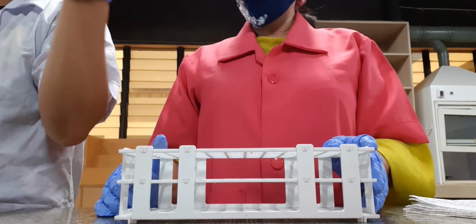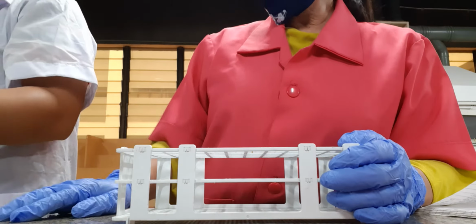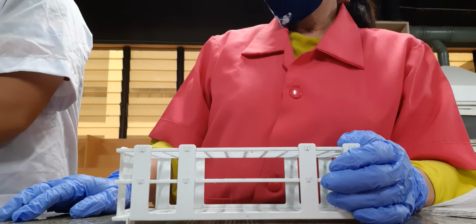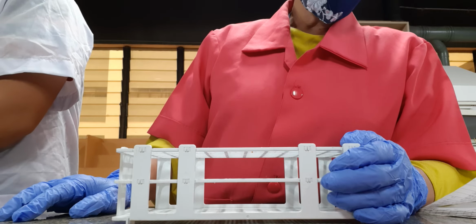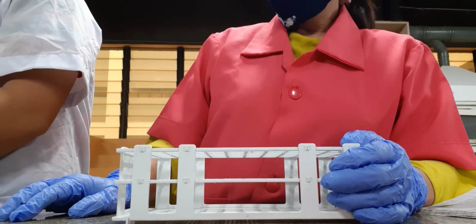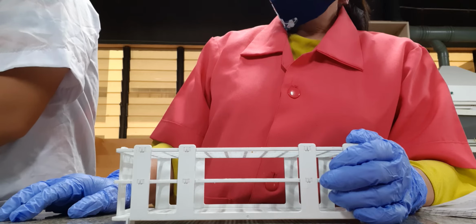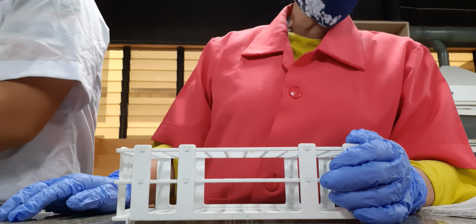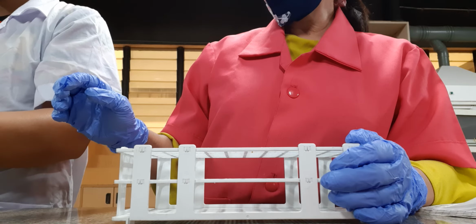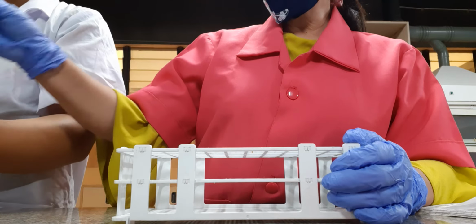So, acetaldehyde. Then number 2 is acetone. First test tube, we have acetaldehyde. The labels are the same for all other test tubes.